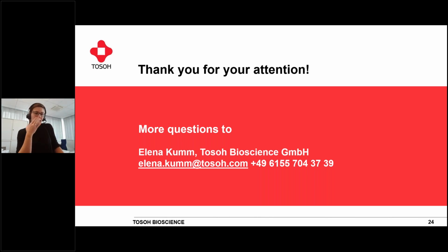In case you take a weak cation exchanger, it's of course ionized differently at different pH values, but it's more sensitive, and you can influence it much better. So often customers decide for a weaker cation exchanger, but it doesn't mean that it's really the best choice for the protein of interest. So as I said, the best thing is really to try a bit of both variants. I hope this answered the question.